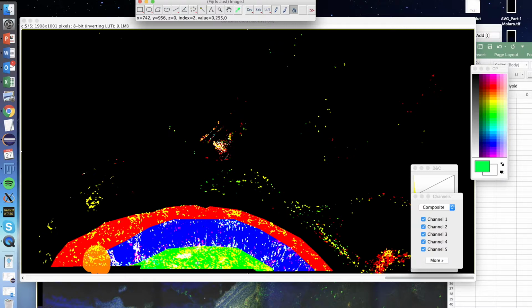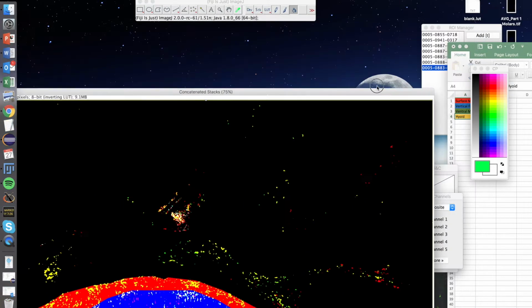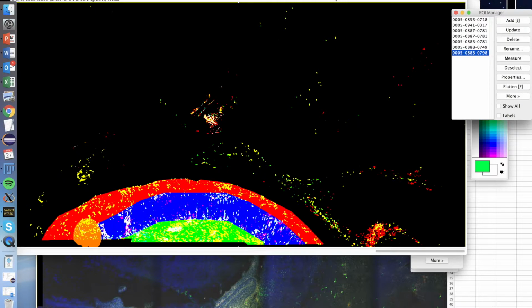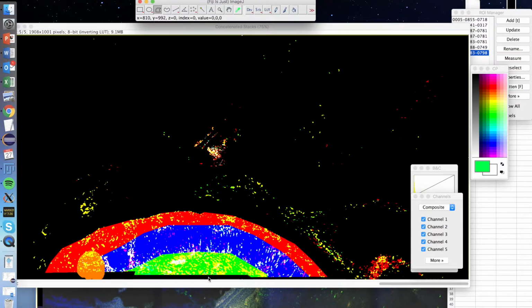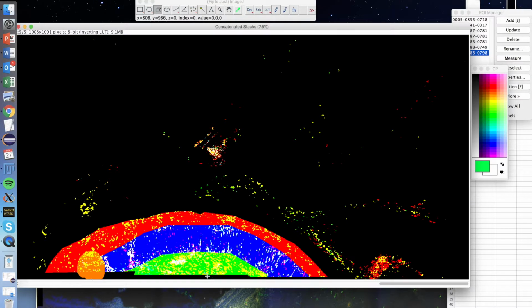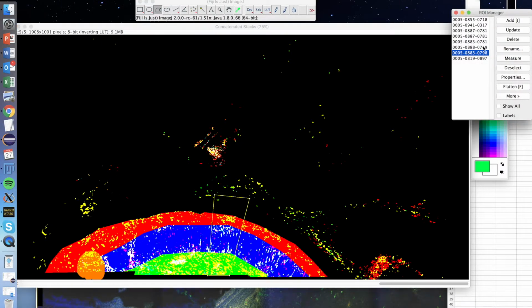That's done it into a few layers. But maybe later you're going to find that you want to segment this along itself. That's fine. Let's make a thing where these three blocks are now going to be separate. I'm going to draw a shape just up the image of this, like a nice wedge. There we go. That's fine. We're going to make these three stand out. And I've added it to the ROI manager by clicking T. There we go, that's that shape.